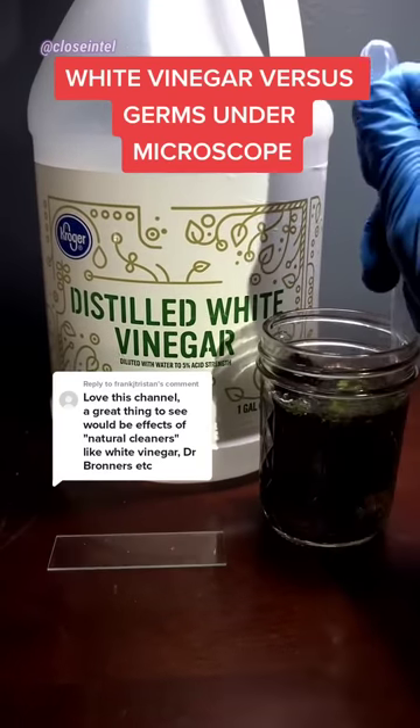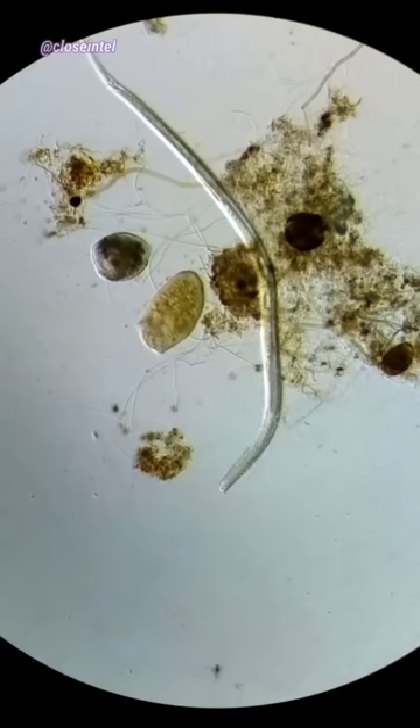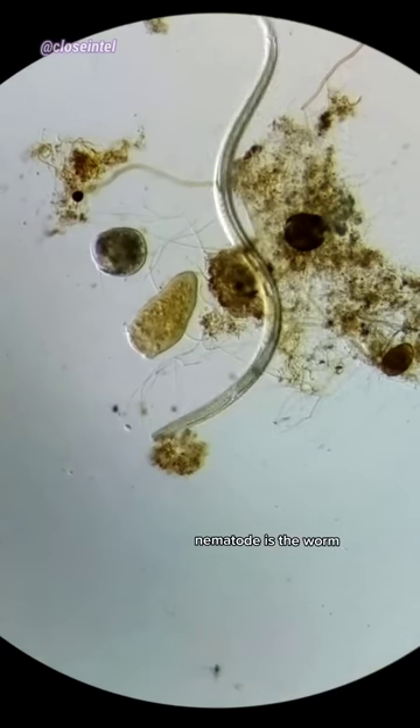White vinegar versus germs under the microscope. First, let me show you what's swimming around in this jar. As you can see, there's some stentor cells, a nematode, and some other ciliates on the surface.